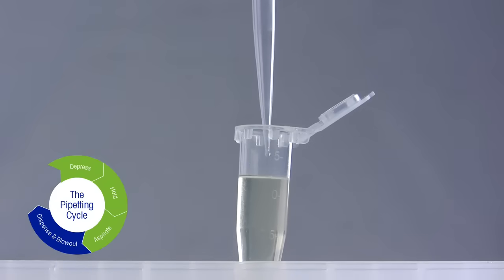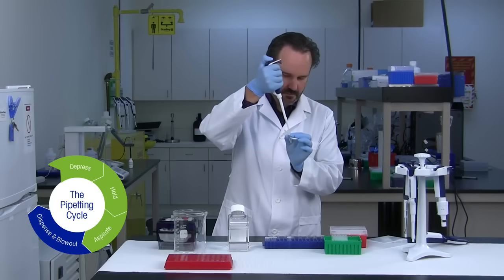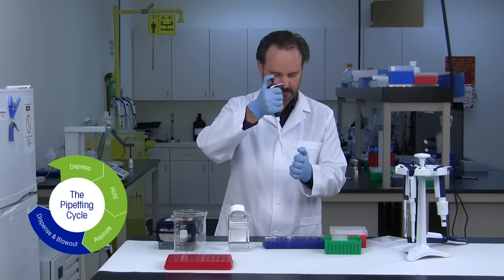Then, with the tip slightly above the liquid, lightly touch the vessel wall with the end of the tip and release the plunger, allowing it to return to the home position.